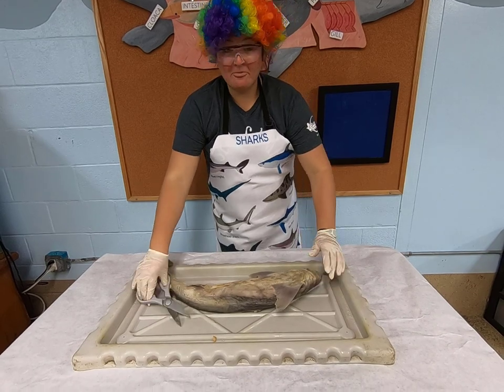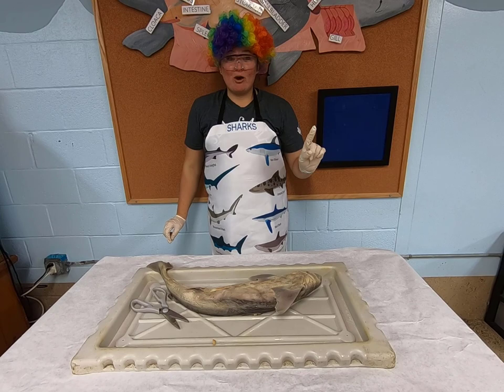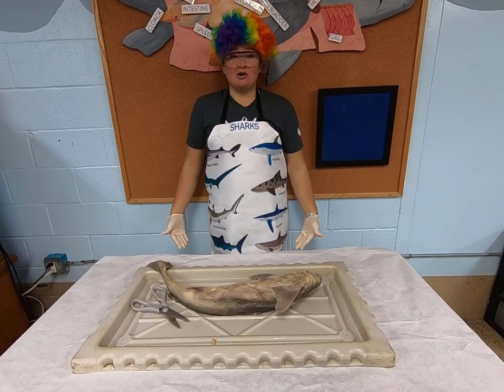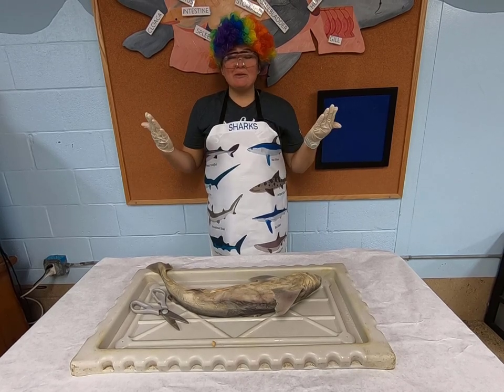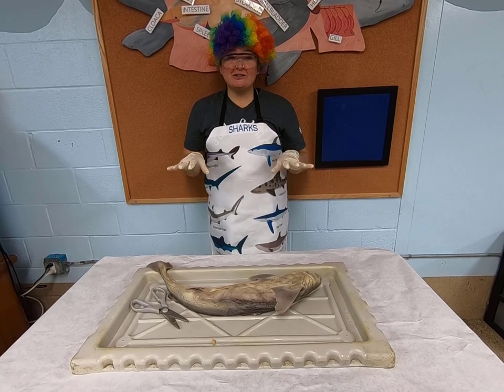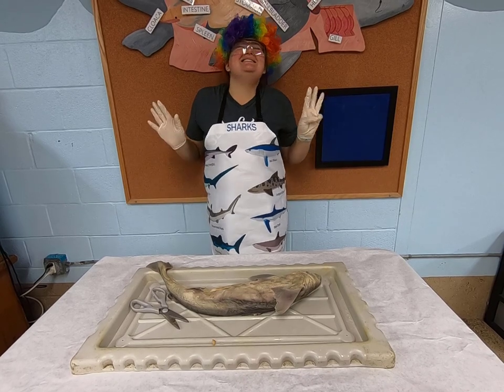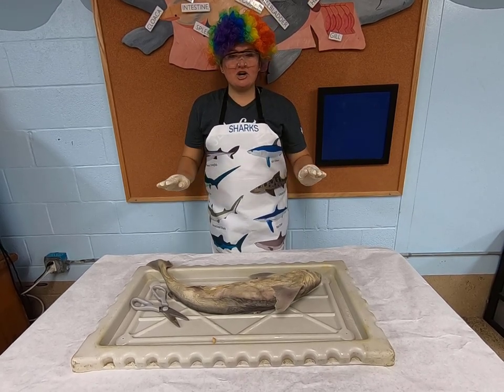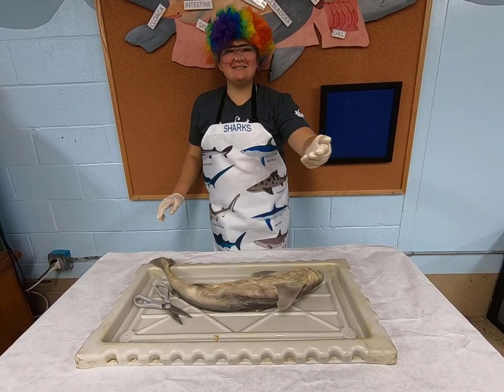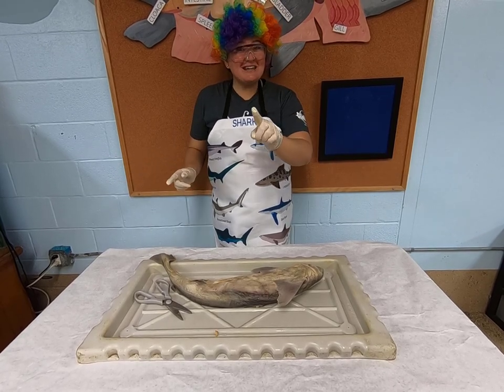So, I have some rules in my shark dissection classroom. Rule number one, we always have safety first. Safety goggles, protect our clothing, protect our hands, and we also need to be positive. This shark has dedicated its life for us to be able to learn. So I don't allow words like ew, gross, disgusting. Those words are not allowed in my shark dissection room. Instead, you have to replace it with how scientific, how interesting, and wow.